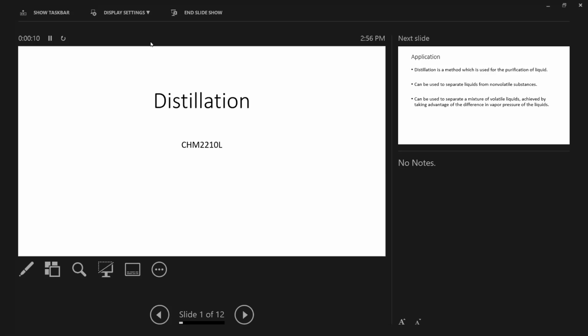So these are some equations that are going to help us calculate the composition of the vapor above the mixture. The only equation you have to know is equation 1. I don't really want to scare you with the math, but I just need to show it to you so you know where I got my numbers from. So if you see equation 1, this is in your lab manual. It's actually a combination of Raoult's law and Dalton's law.